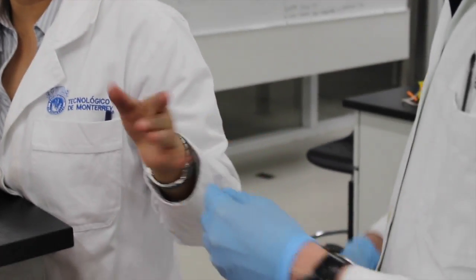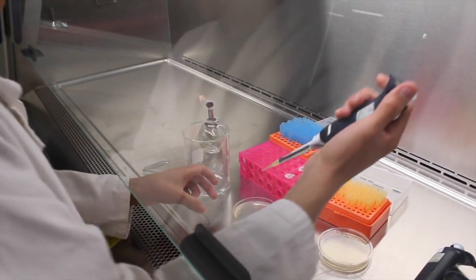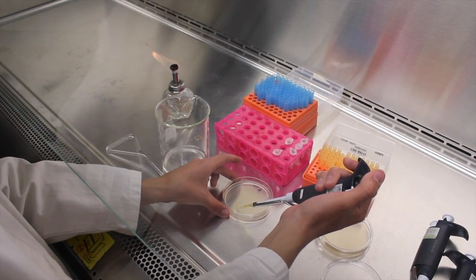3 microliters of the ligation in 50 microliters of chemically competent cells were transformed, using cells that had given better transformation efficiency in the prior practice. After transforming, 300 microliters of SOC medium were added. The solution was incubated at 37 degrees. For recovery of the bacteria, it should be stirred for 1 hour while incubating.